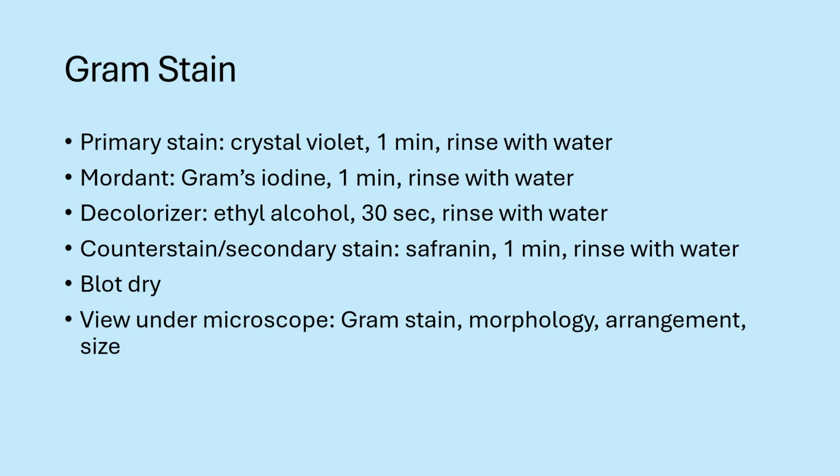Now, with any of these things, first you're going to do the heat fixation. So you're going to take your sample, and you will do this in the lab. Trust me, this is one thing you have to do in the lab. You will take a sample of bacteria, and this is for bacteria. It may be from a liquid broth, it may be off a petri dish, however you get it. You're going to smear it on a slide, and then you're going to heat fix it. Because remember, that's going to kill it. That's going to stick it to the slide, and that's going to make all of these stains more readily penetrate that cell wall.